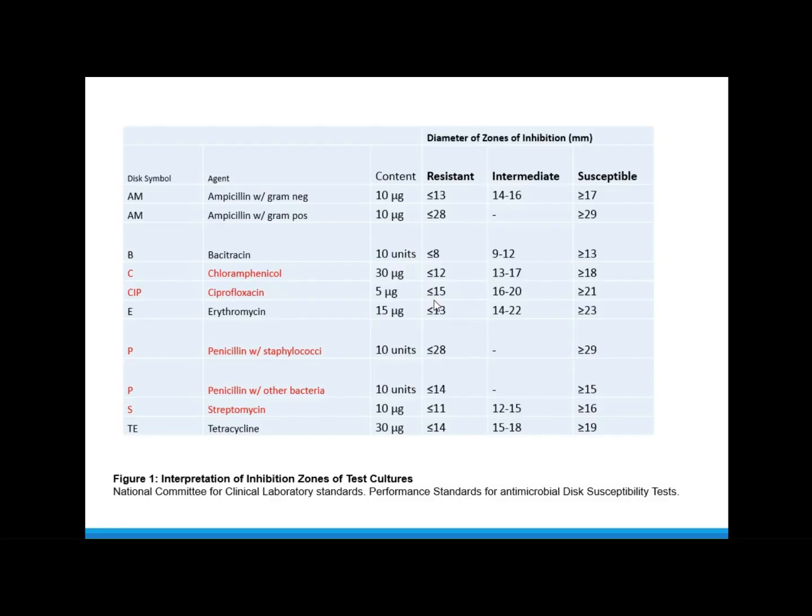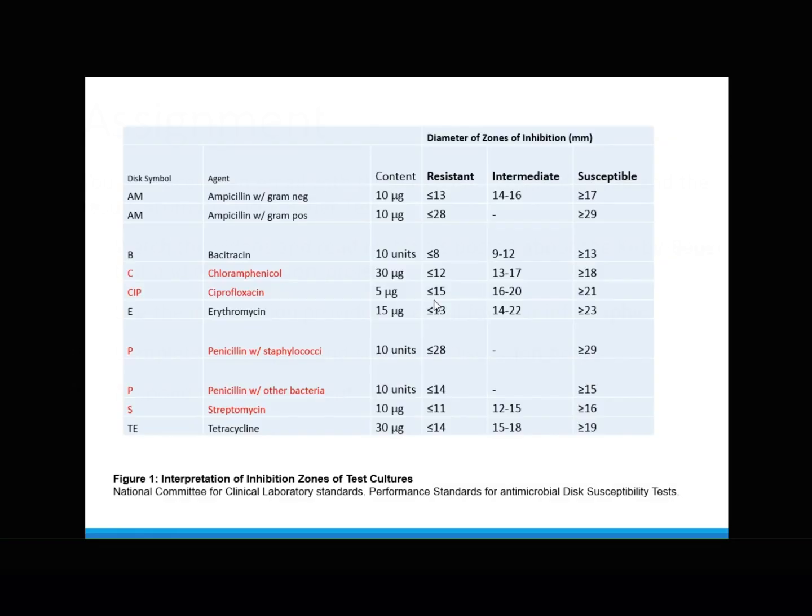Okay, and just a word to the wise, it is the bacterium that is resistant or susceptible. It is not the antibiotic. So I didn't say penicillin is susceptible. I said that Micrococcus luteus is susceptible, or the bacterium is susceptible.